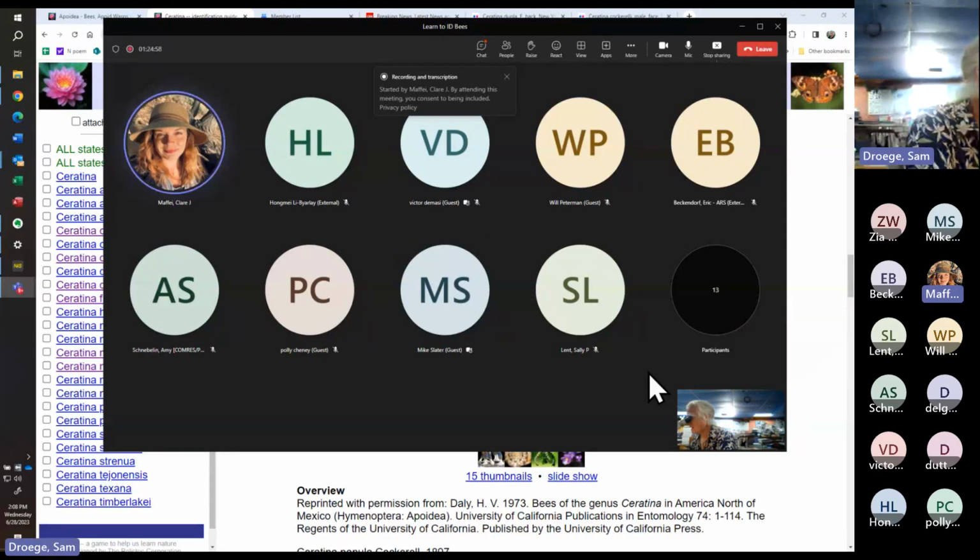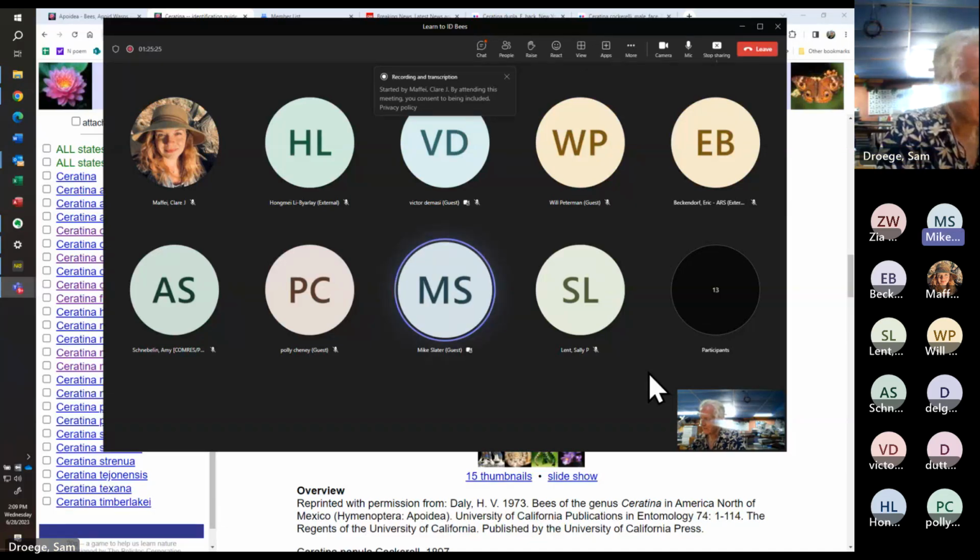Right. Did you see something about that in any of the photos? Well, it was quite visible in that one photo that Sam kept looking at. Okay, so I'm looking here too at a specimen. I think I see what you're talking about actually, and yes, Mike, you are correct, at least on this specimen. It's something that no one ever mentions, though. It's very subtle. I'm just wondering if that might confuse some people about what's a parapsidal line and what's that line.